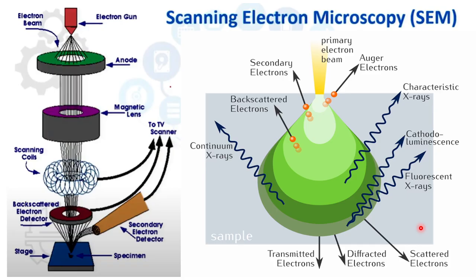So usually those who are working in metallurgy will investigate or study Auger electron spectroscopy, cathodoluminescence or characteristic X-ray. But in the case of TEM, it is not the Auger electron or X-ray. The same electron that I am focusing on the sample is transmitted through the sample, and that's why you need a special preparation for the TEM analysis. You need a special preparation. You need a TEM grid.